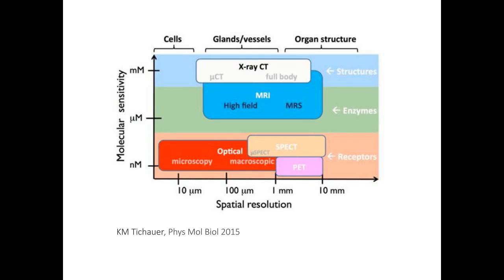So the ones that we tend to have here at UCLA do span everything that you see here. Even in the clinic, we have SPECT scanners and PET scanners, CT, MR, and optical. In the preclinical setting at the Crump, we focus mostly on PET, CT, and optical imaging, and then to a certain degree, we also collaborate with another center on campus for MR. So generally speaking, we do have all these modalities available to our users.